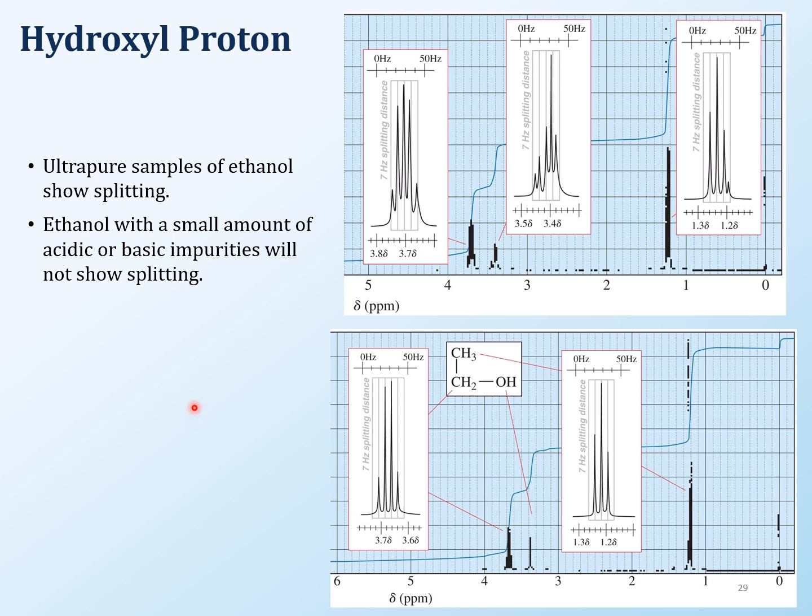So here is the hydroxyl proton, and of course, the OH and the NH peaks are going to show up in there. Here is, for example, the alcohol peak right there for ethanol. And in this case, this is a very, very pure sample of ethanol, so there's a lot of splitting going on in this. That's something that happens when you also have good instruments. I think all of these spectra that I'm showing you are coming from one textbook, and I think they took all their spectra mostly in 300 megahertz NMR. So this is pretty good resolution and very good spectra that you are seeing right now. Here's a normal ethanol, where you would see a triplet, a quartet and a singlet. But in this case, in ultra pure, you're seeing a little bit more splitting going on. I wouldn't worry too much about this for now.